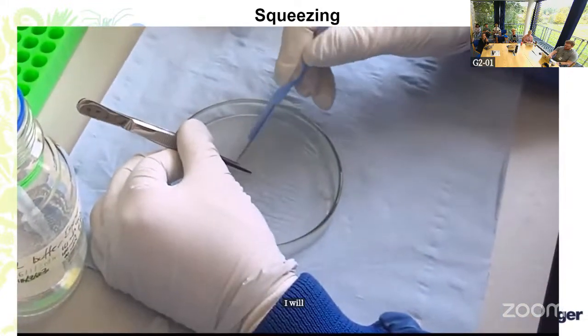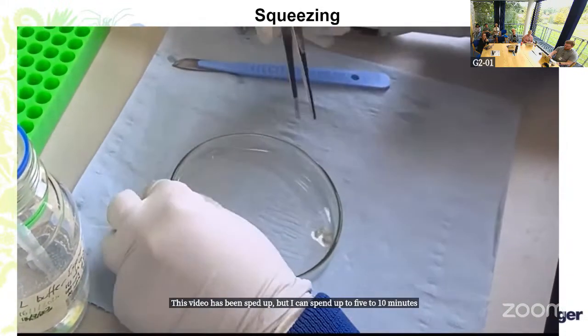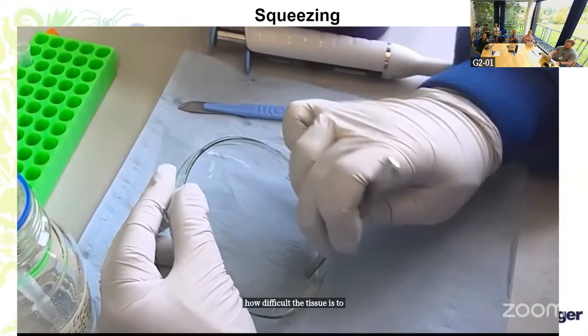This video has been sped up, but I can spend up to 5 to 10 minutes per sponge, depending on how difficult the tissue is to break up and fragment.